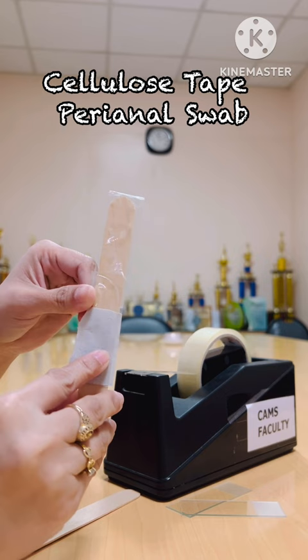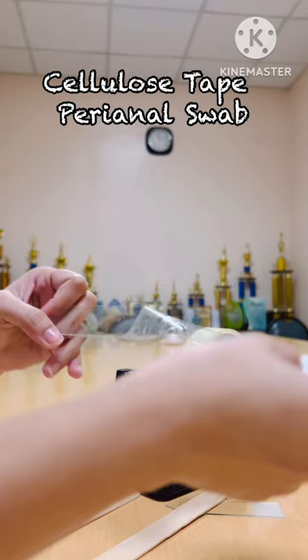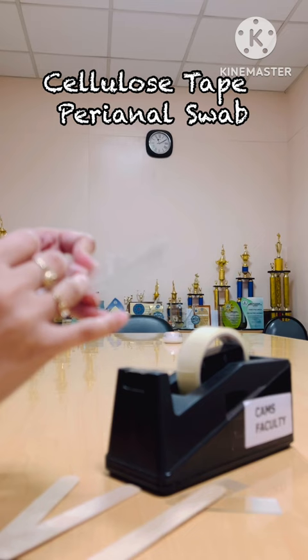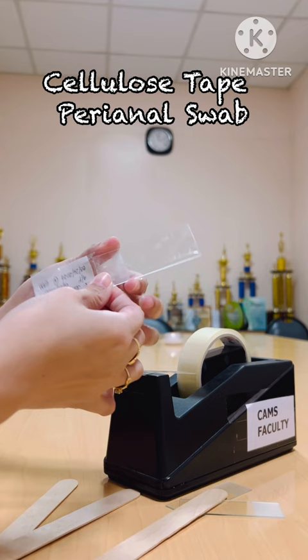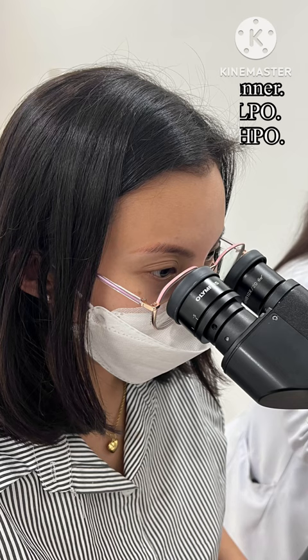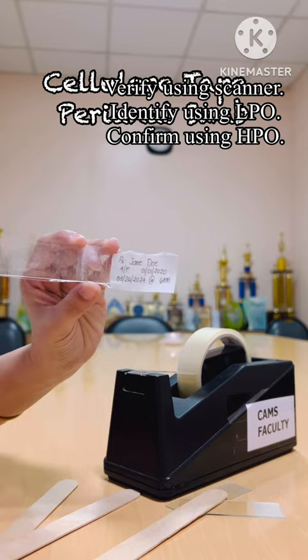Once you are satisfied with the collection, remove the tongue depressor. Then add a drop of toluene or xylene, which will serve as a clearing agent. Close it totally, and while waiting for it to fully clear, you can start preparing your microscopes. Then read it under the microscope for verification and identification.